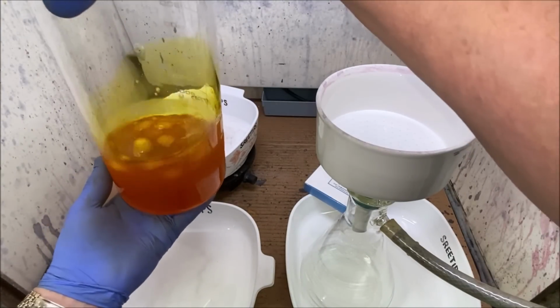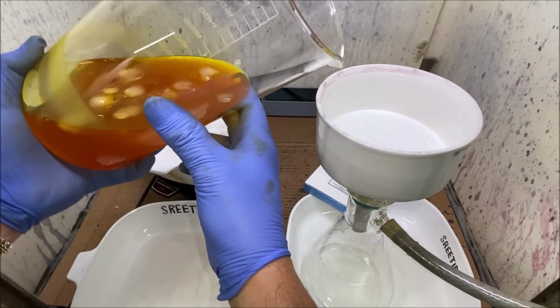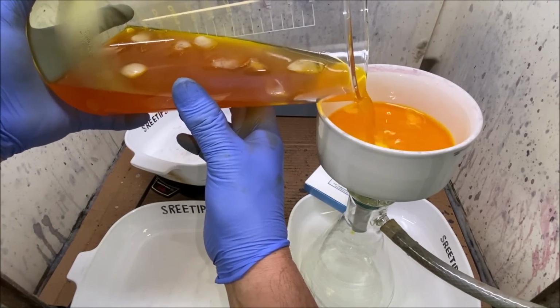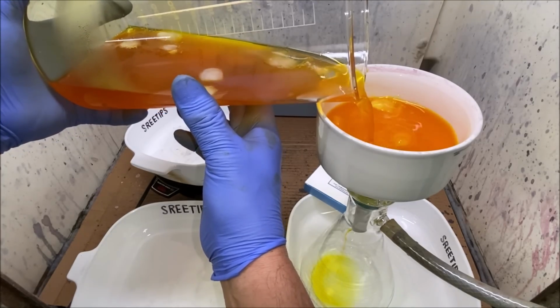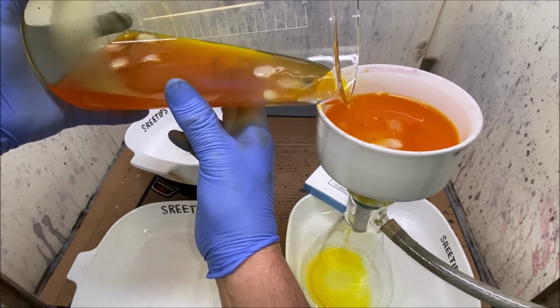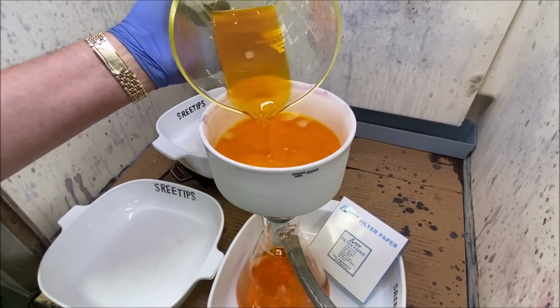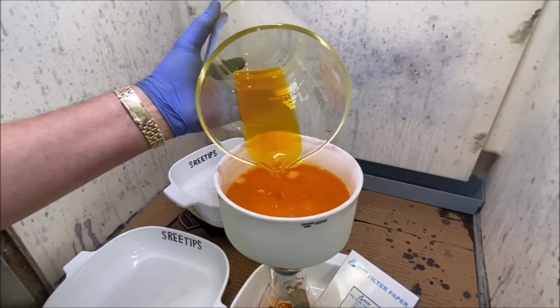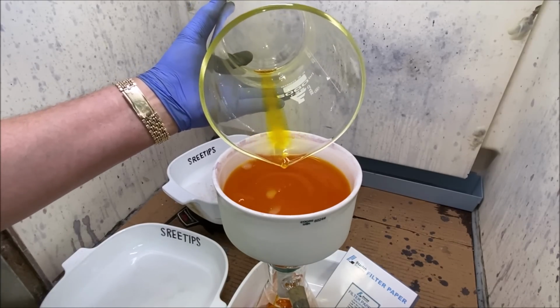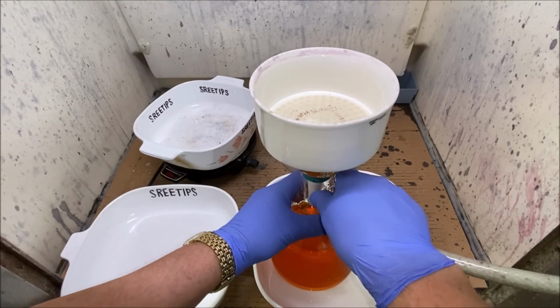is we're going to filter this now. Get out the filter paper. Here we go. There's a little bit of gold left up in the bottom of that beaker.